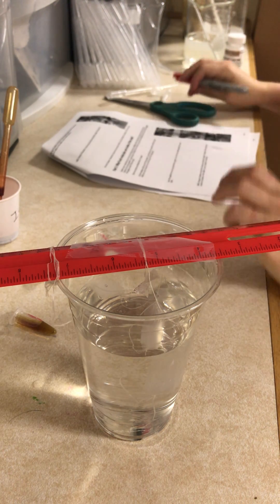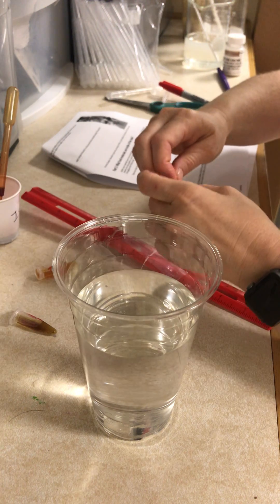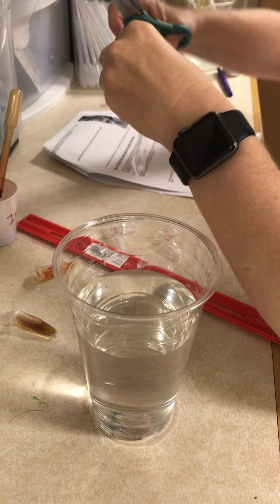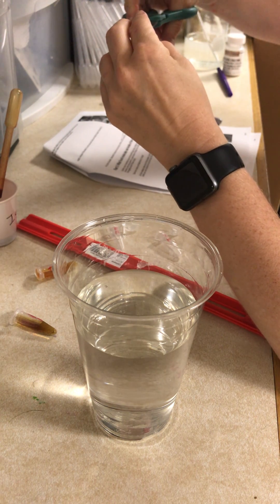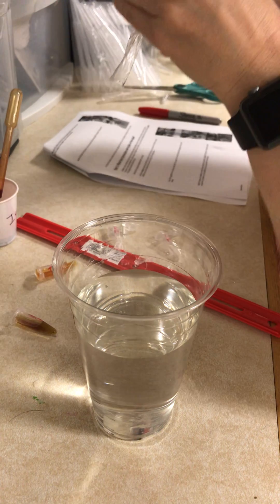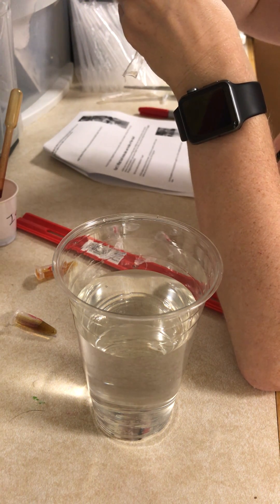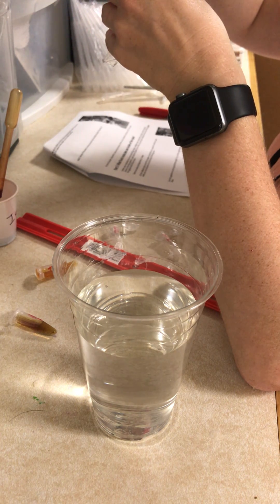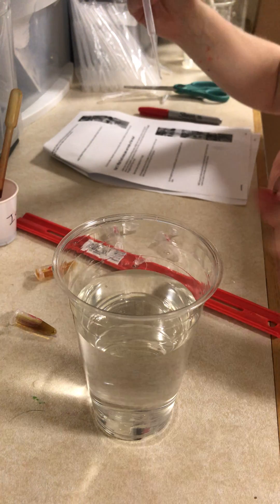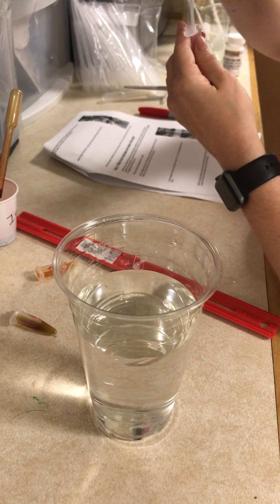I'm going to take two tubes and label them 'inside.' Now I have to cut the dialysis tube — I'll take it out of the beaker and hold the knot and cut right below it. Students can do this with a partner, one person holding and one cutting. Then I'll take a clean pipette, insert it in the tube, rub it a little to separate it, suck up the liquid from inside, and put one milliliter of the inside liquid into each of my inside tubes.